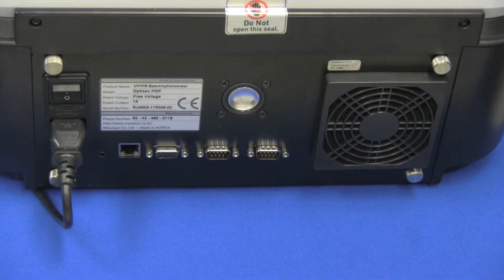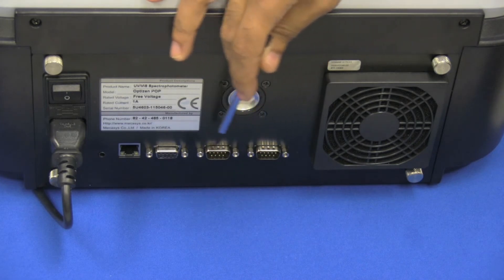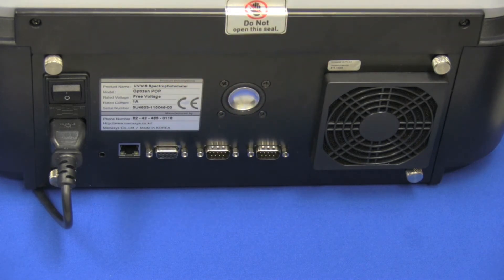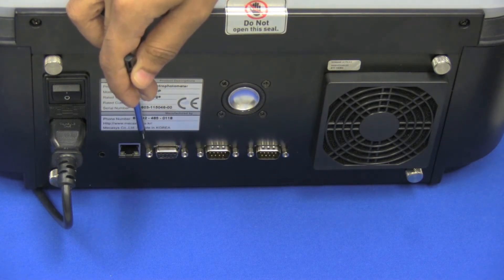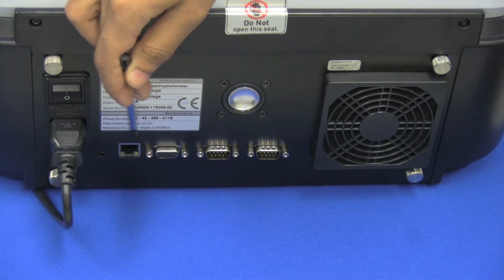Earlier I mentioned that the instrument has four USB ports, but we're not limited to just those. There are also three additional RS-232 ports for connectivity to additional peripheral devices you might want to use with the instrument. In addition to that, there's a network port here, which can be used for network printing as well as firmware updates and diagnostics over a network.